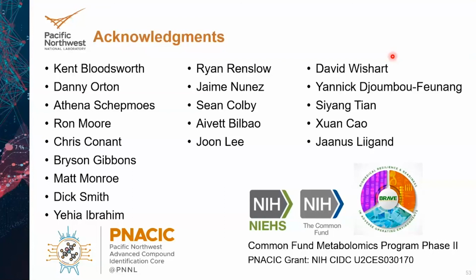I believe that will be the case, but we need to do additional work. This is what we refer to as chemical space. You've got this multi-dimensional space of these many properties that you're measuring, and you've got, say, a point out there in that space. I personally would like to know, well, I think this particular point in this multi-dimensional space is this molecule. I want to know what are the next closest points around that point in that multi-dimensional space. Maybe it's a big gap, even with the relatively high errors in retention time or MSMS prediction.